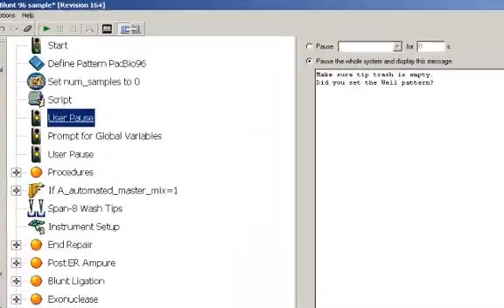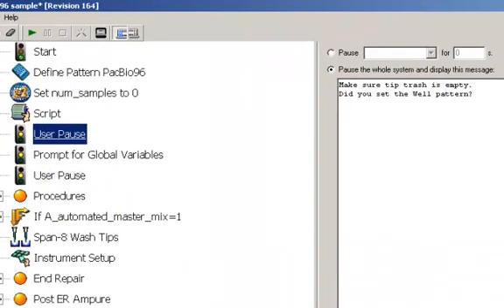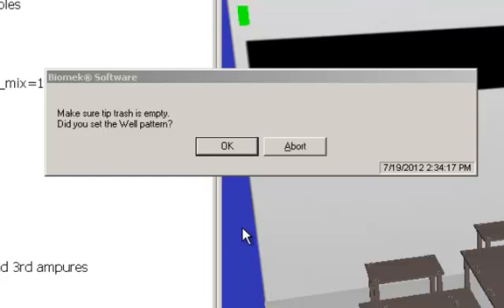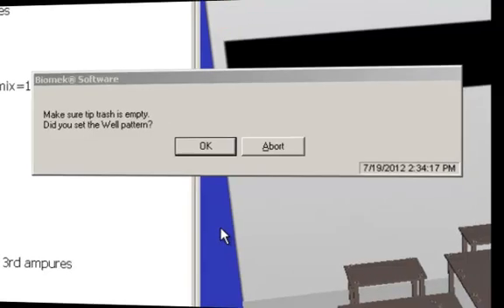Now that we've defined the pattern where the samples are in the 96 well plate, there's three user pauses and we're going to go through each one of these and explain what they do. The first user pause will show this window asking you to make sure that you empty the tip trash and to make sure that you define the well pattern. It gives you a chance here to end the method and take care of those things if you didn't take care of those things before the method runs.